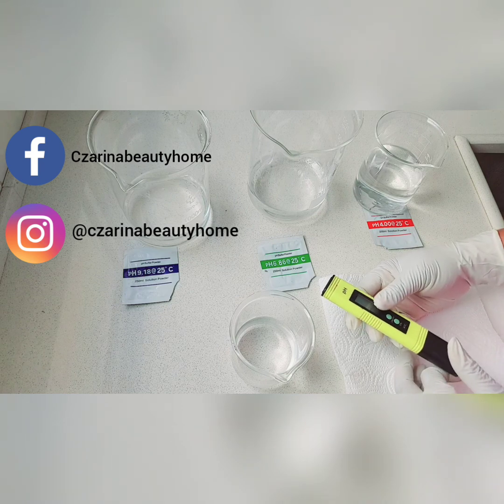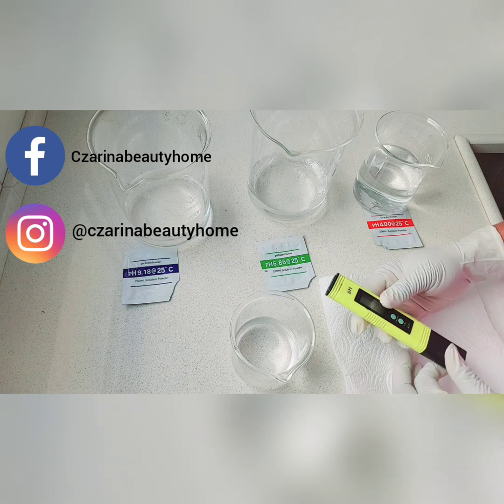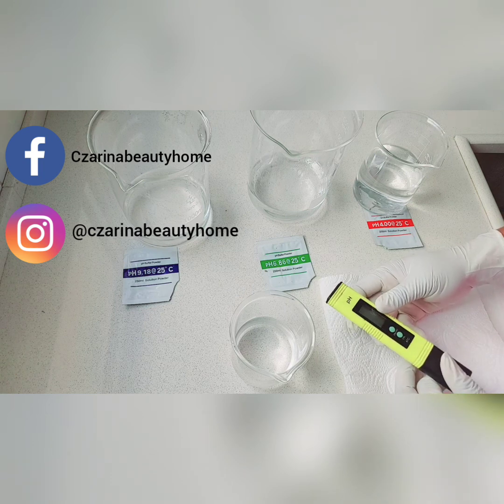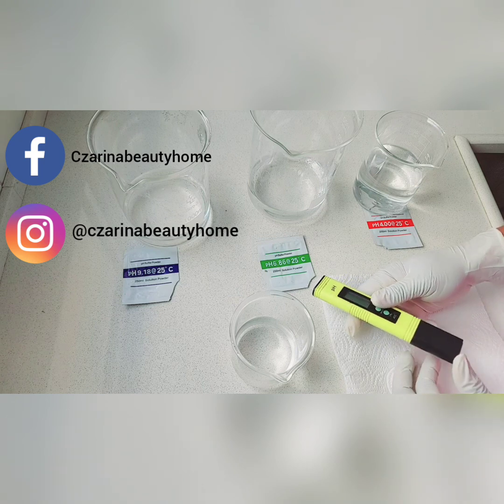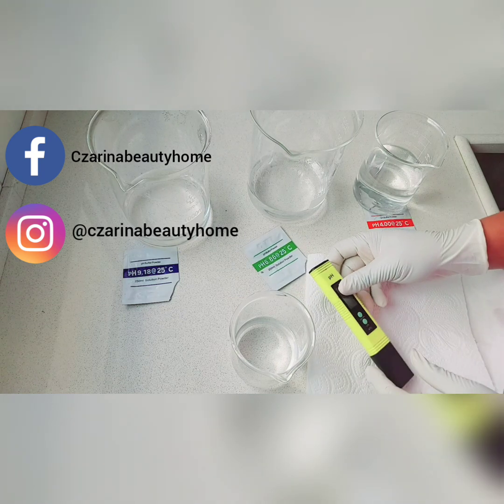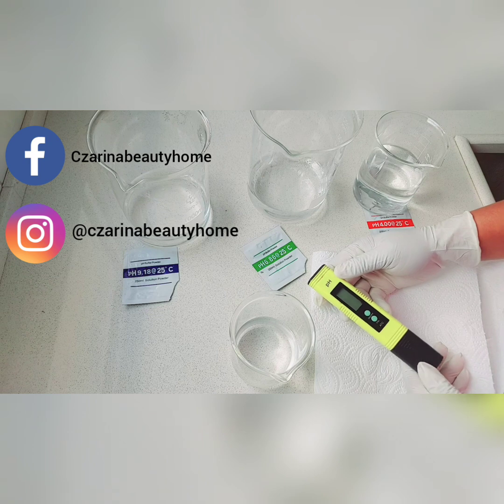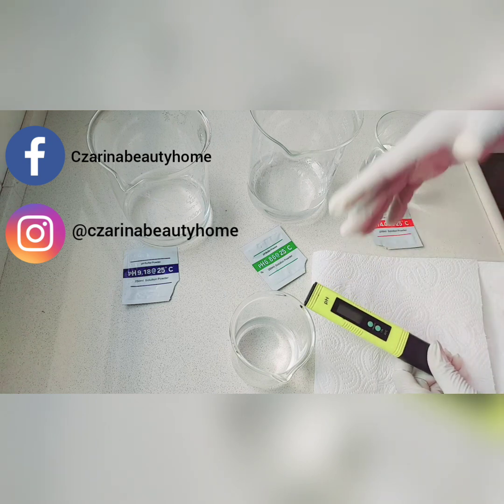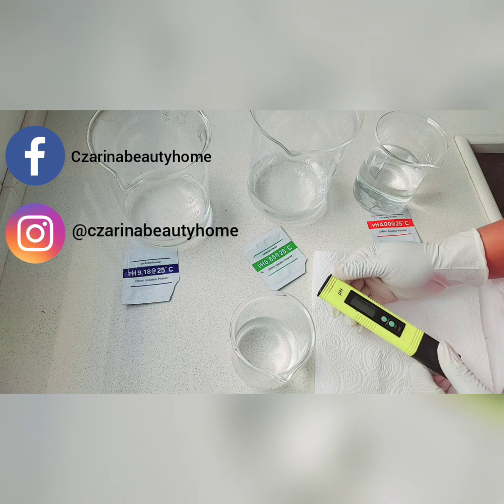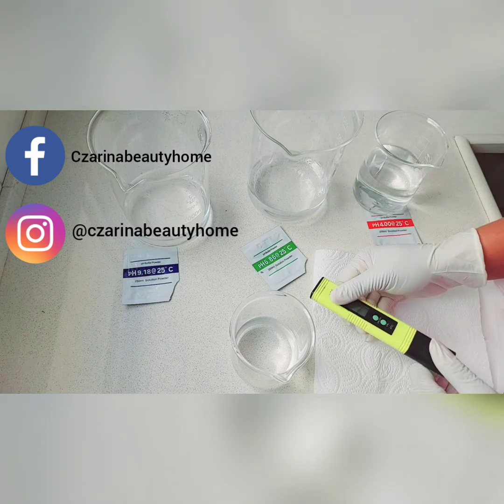If you're working with any pH meter — be it the advanced one, which I don't have here right now, you'll see me use it in my subsequent video — the reason I'm doing this illustration with this particular pH meter is because it's the one that most people, especially new formulators, tend to get. It's quite cheap and affordable. The problem with this pH meter is that it needs to be calibrated each time you want to use it, especially if you're not a regular formulator — maybe once in two weeks or once a month — then any time you want to use it, you have to calibrate it.